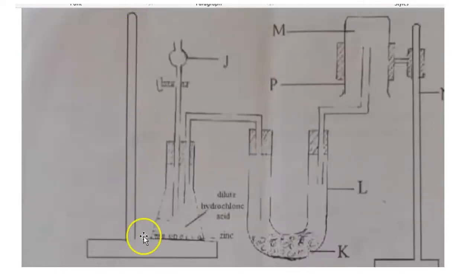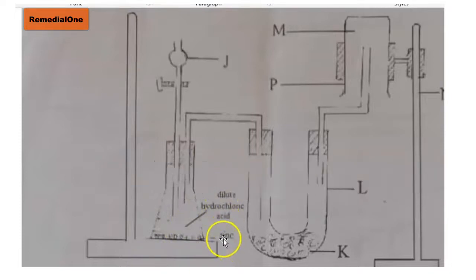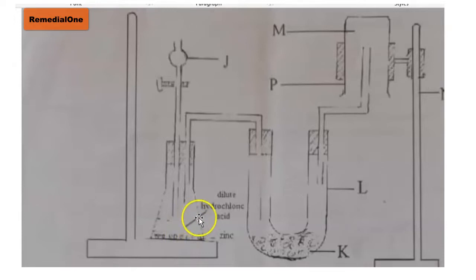We have a stand here, and there is a conical flask here. Inside the conical flask there is diluted hydrochloric acid and also zinc metal or zinc granules. Because of these two reagents — diluted hydrochloric acid and zinc granules — we are very sure that the gas being produced here is hydrogen gas, which is why we are looking at the preparation of hydrogen gas in the lab.